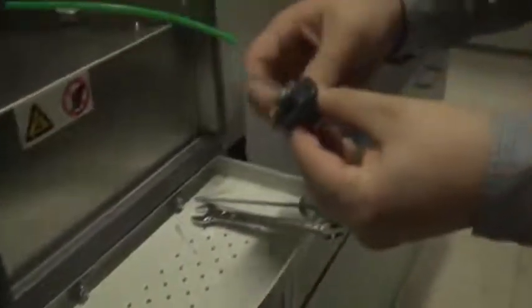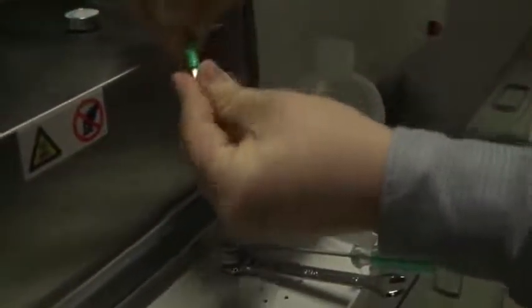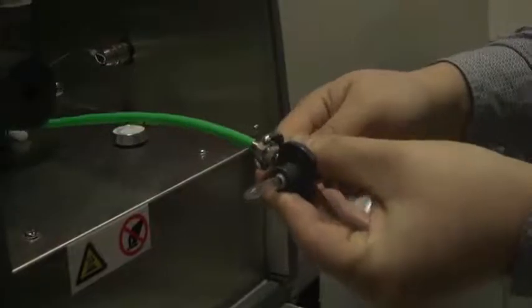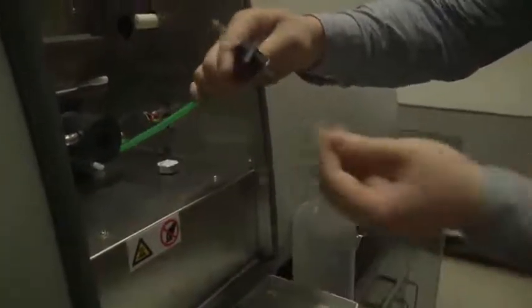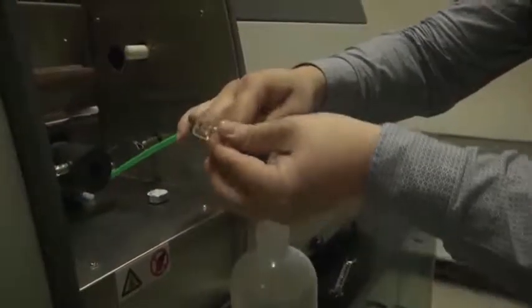First, take off the screw nut on the nebulizer body, put it through the end of the air tube, and then connect it with the nebulizer body and tighten with a spanner. Place one O-ring on the nebulizer body, connect the capillary with the nebulizer, and put the head on the nebulizer body.